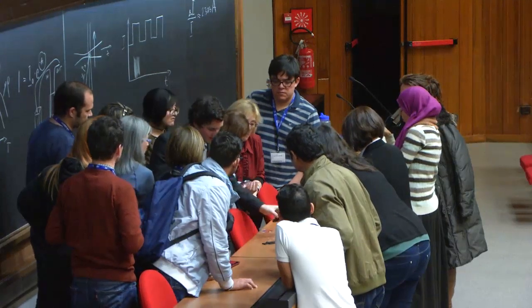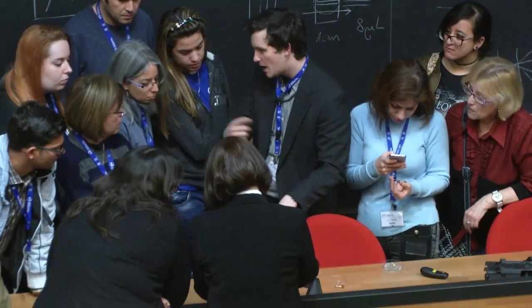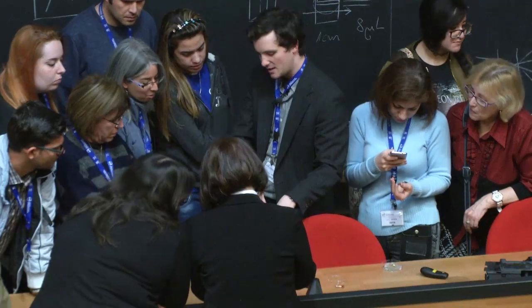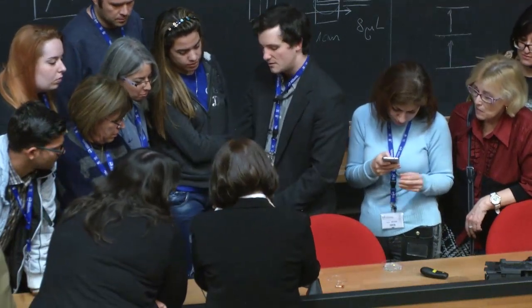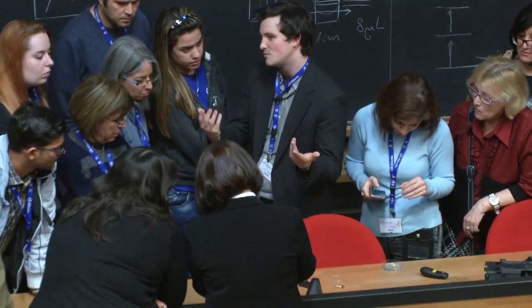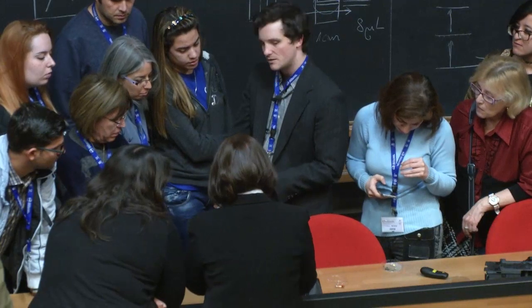For instance, I was able to send this image from here to LA, and it got back to us within about 2 minutes, and it gave us a cyst count. Doing it on the mobile phone here, there's no point because we're in a Wi-Fi space. And you can do it with a cell network too.